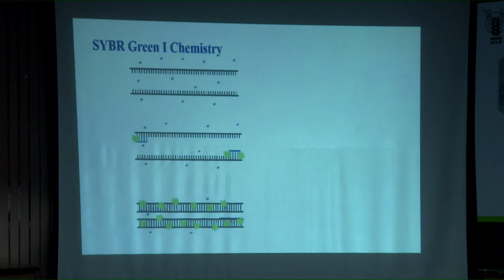The template is double-stranded, all right? Agreed or not? It's double-stranded DNA as a template here. And in terms of quantity, how much are you using as a template? Maybe 25 nanograms or 50 nanograms. That is an extremely small quantity, right?